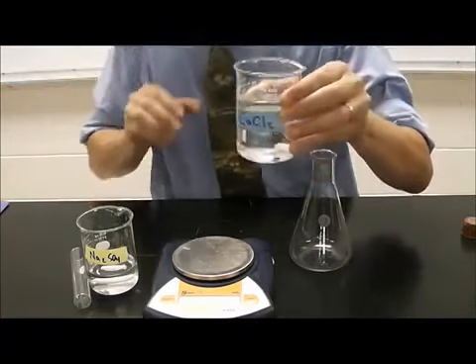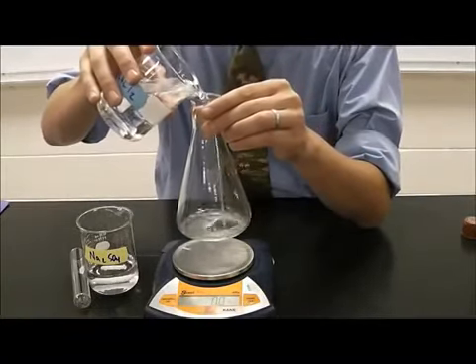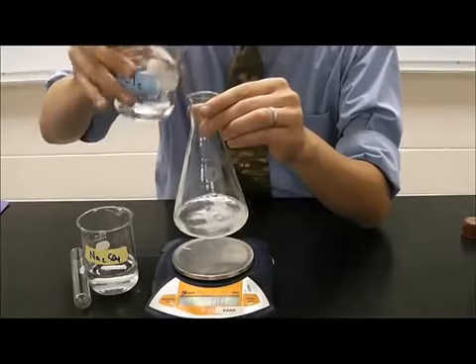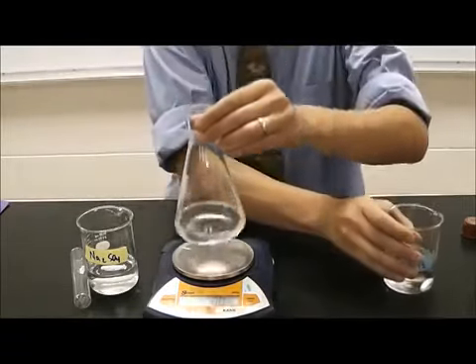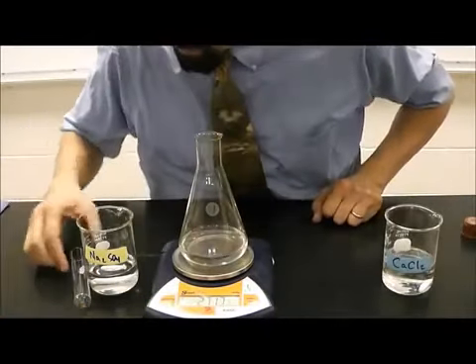I've got some calcium chloride here, which I'm going to place in the Erlenmeyer flask. Exact amounts are not necessary in this demonstration, so that's probably about enough. Place that on my balance here.